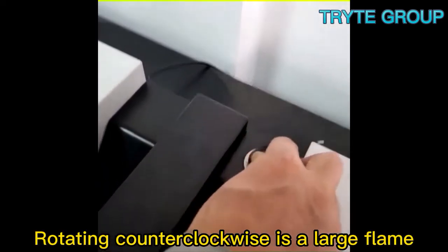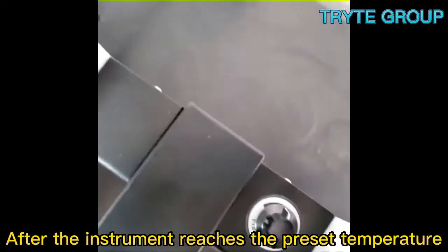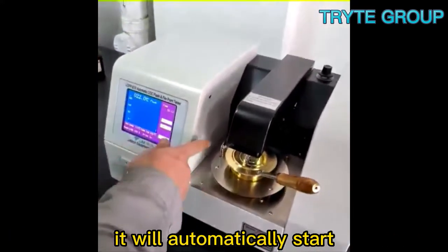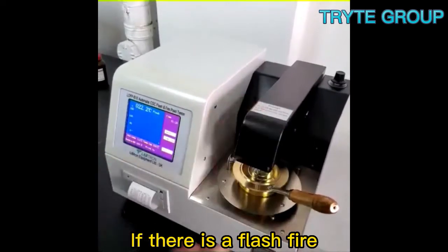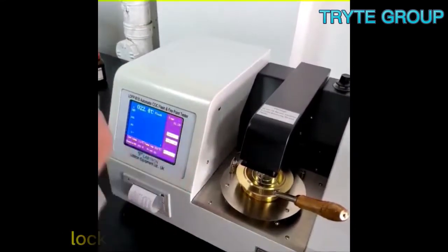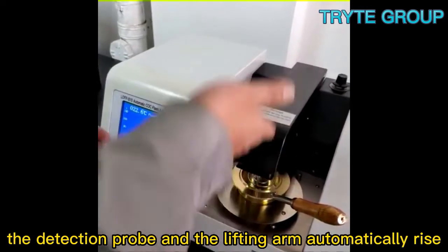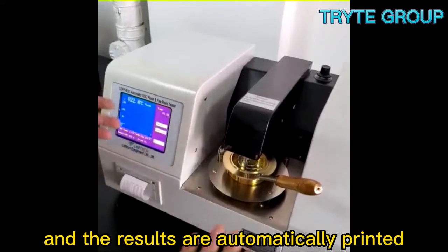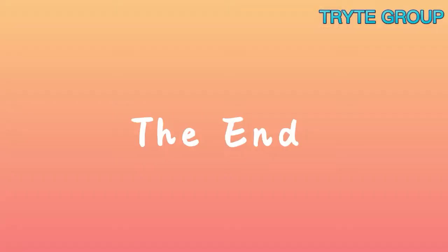Rotating counterclockwise produces a large flame, and clockwise produces a small flame. After the instrument reaches the preset temperature, it will automatically start sweeping across the liquid surface. If there is a flash fire, the instrument can automatically detect and lock the temperature, stop heating. The detection probe and the lifting arm automatically rise, and the results are automatically printed, and the entire experiment is completed.